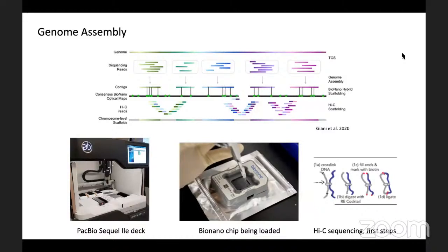All right, so again, as I was saying, we have multiple technologies that are needed to achieve the quality that we want for our reference genomes. And in particular, currently we have three models. One has now this method that generates so-called circular consensus reads, very, very high quality. There are very few errors. They're still very long in read length, usually around 20 kb.